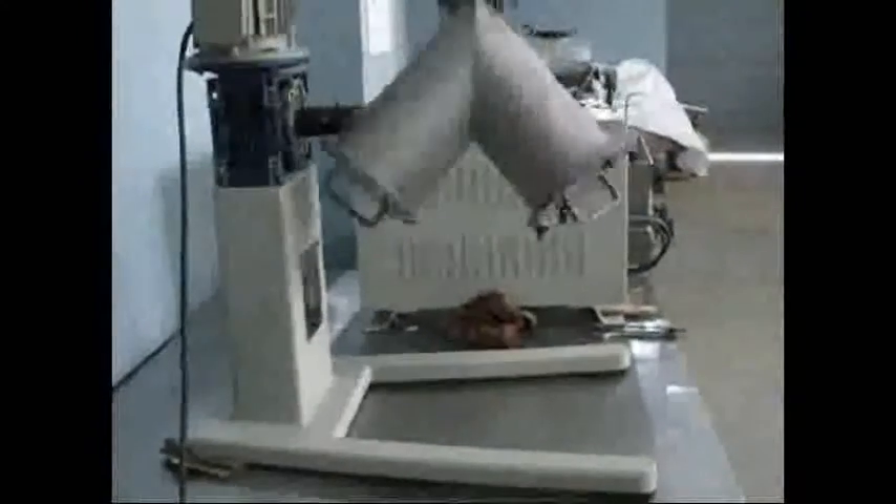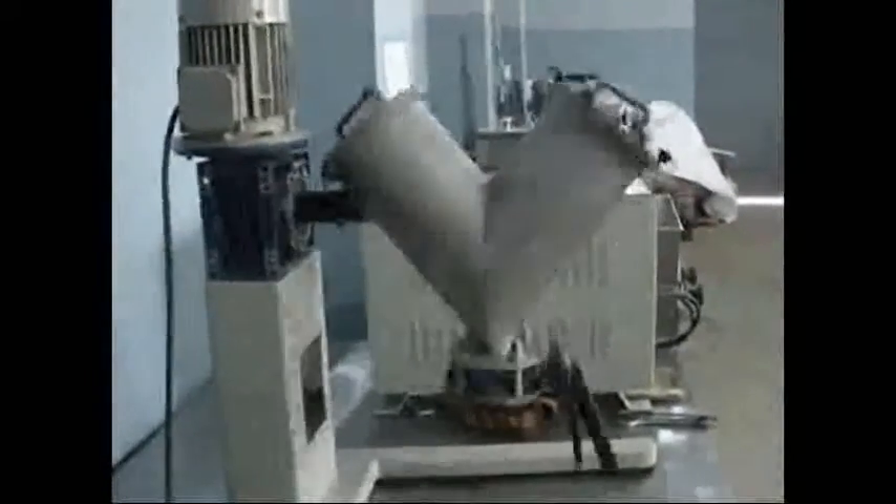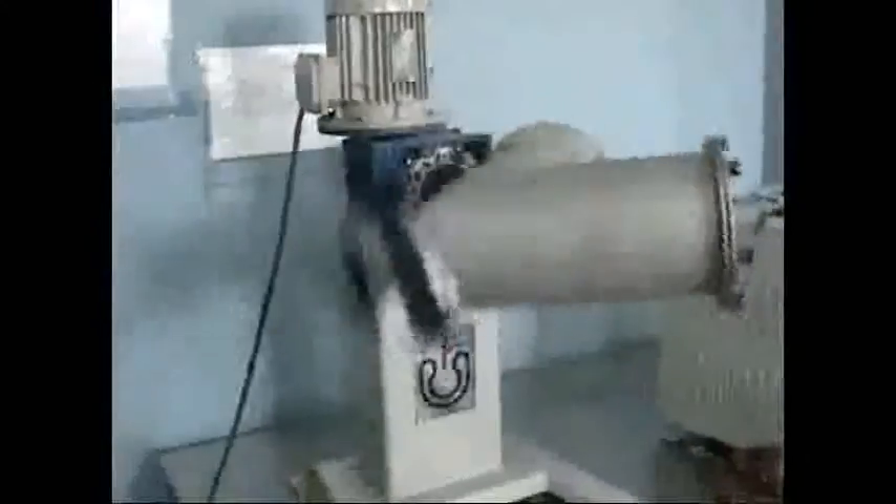The primary mechanism of blending in V-Blender is diffusion. In the absence of segregating effects, the diffusive blending will in time lead to a high degree of homogeneity. V-Blenders are therefore preferred where precise blend combinations are required. They are also well suited for applications where some ingredients may be as low as 5% of the total blend size.